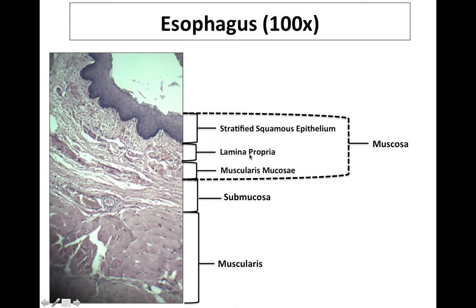So with the esophagus itself, when you take a look at the mucosa that's right there, you actually see a series of 3 different layers. So of course this image is flipped upside down in reverse to what we just saw. Here you can see the muscularis, and here you can see the submucosa. The idea right here is that lining the lumen is going to be the epithelial layer. Now in the esophagus, because there's quite a bit of friction that the food is going to create along the lining here, this is stratified squamous epithelium. More layers of epithelial cells means more protection.